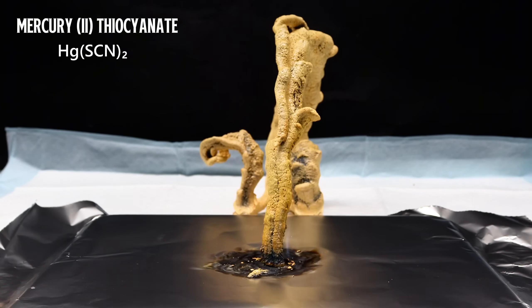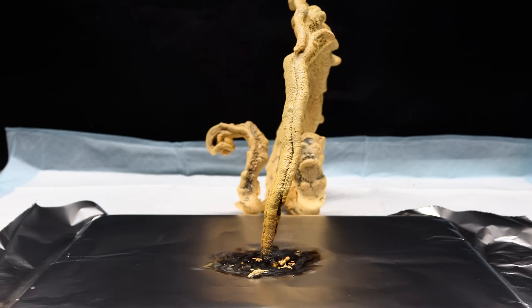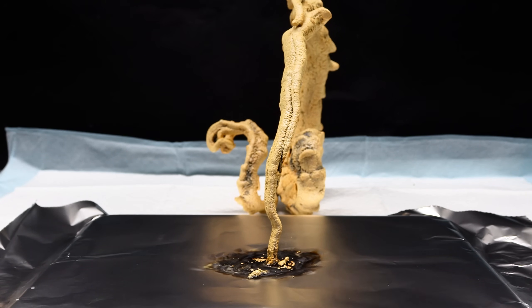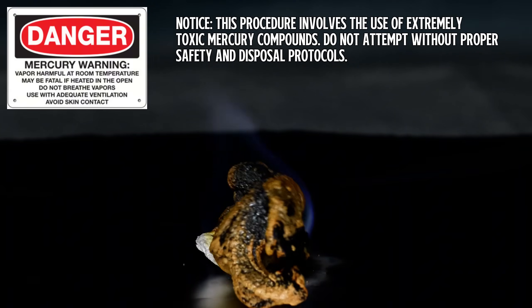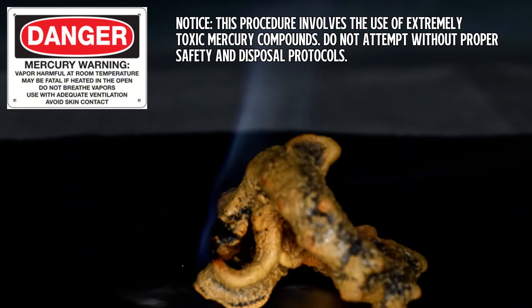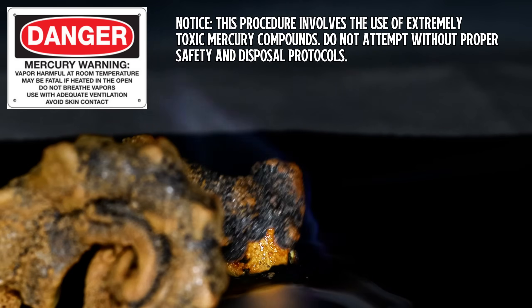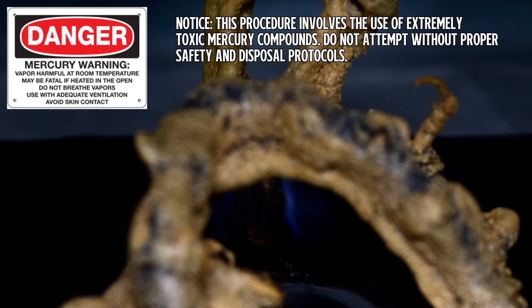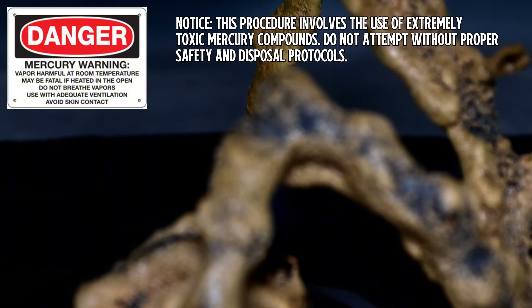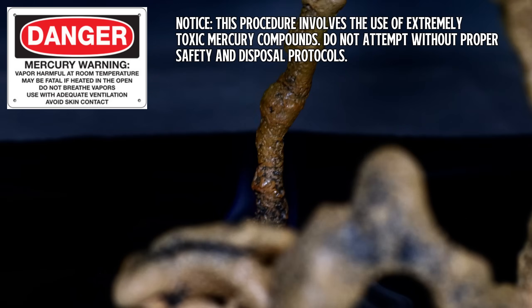Before I get started making this weird and very toxic chemical, I want to be clear that every step of this process deals with extremely poisonous mercury, and should only be attempted if all appropriate precautions are taken, and if you have the means to dispose of any mercury waste produced. Not only is mercury an acute and cumulative poison, it's also extremely dangerous to aquatic life, even in very small amounts.